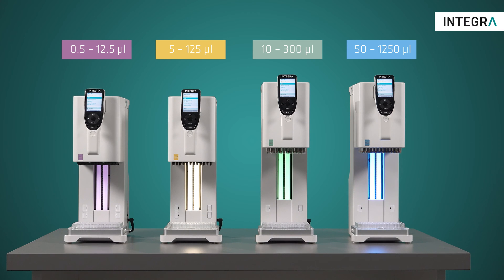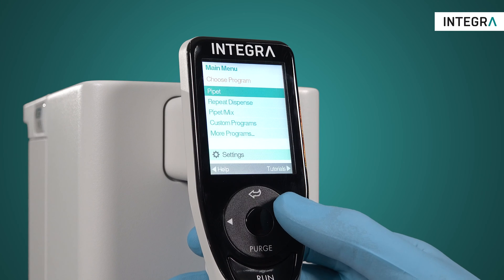Much like traditional handheld pipettes, the MINI 96 is available in several volume ranges: 0.5 to 12.5 microlitres, 5 to 125 microlitres, 10 to 300 microlitres, and 50 to 1250 microlitres. So your application's volume is sure to be covered.